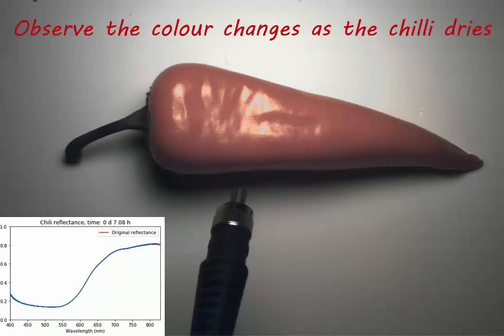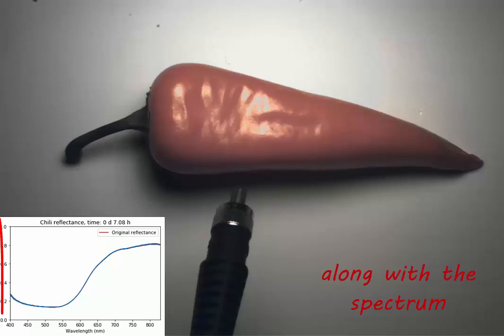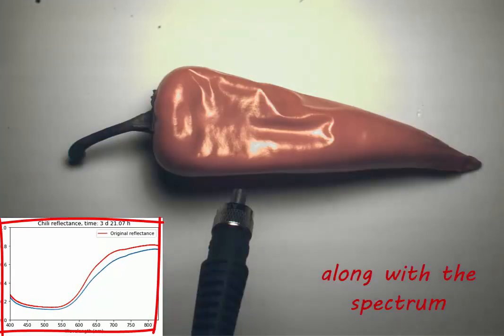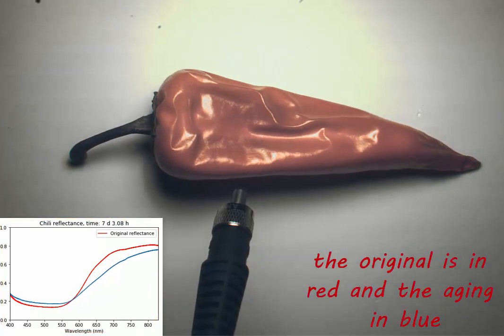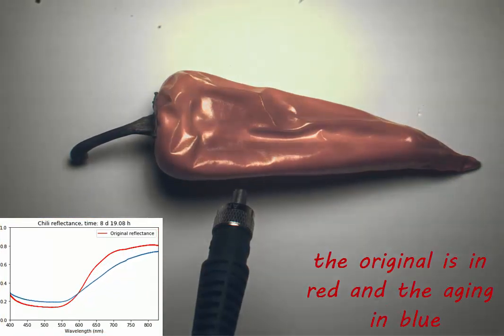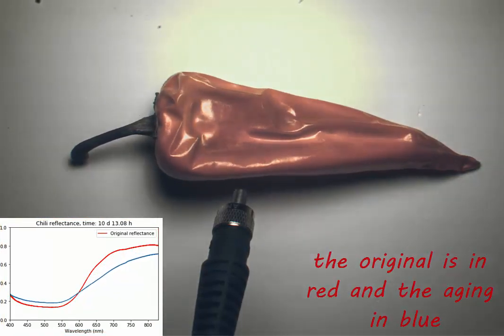See how the colour of the chilli changes as time passes. This is seen in the spectrum by showing which wavelengths of the illumination are reflected back and which are absorbed. The original spectrum is shown in red and the ageing spectrum in blue.